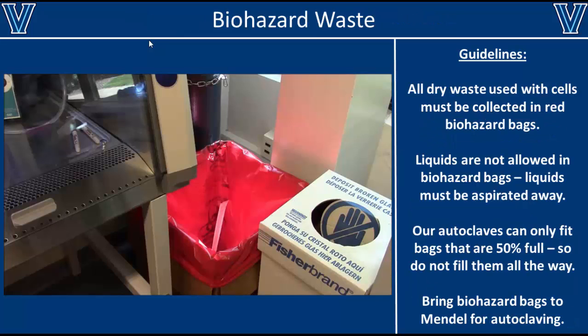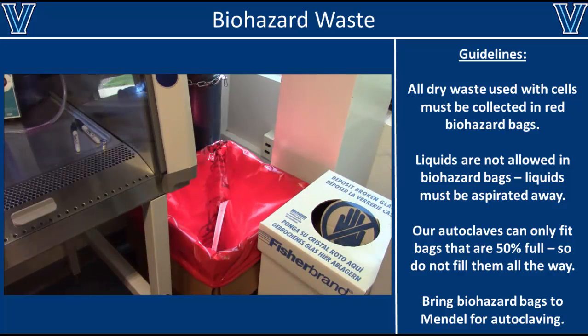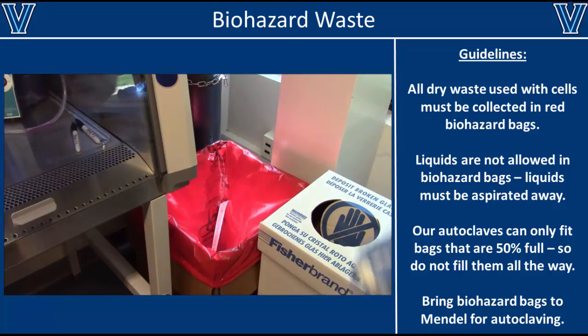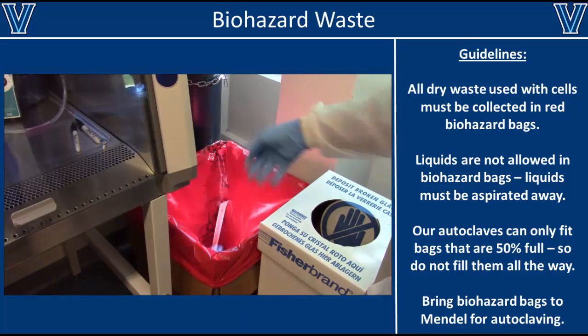Speaking of biohazardous waste, any lab that does biological research is required to have a biohazardous waste box. At all times, the biohazard waste box should be lined with a red biohazard waste bag. Most kinds of dry biohazardous waste can be disposed of in these red boxes. For example, you might use them to throw away pipettes, empty 15 or 50 ml tubes, paper towels or chem wipes, and even the latex or nitrile gloves you use on your hands.